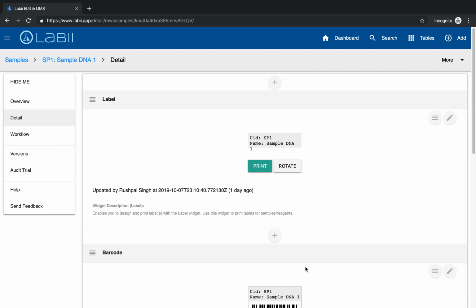For a quick refresher, a barcode is a method of representing data in a visual machine readable form. Initially barcodes represented data by varying the widths and spacings of parallel lines, and now these barcodes have dramatically expanded from one-dimensional and can be scanned by special optical scanners called barcode readers.